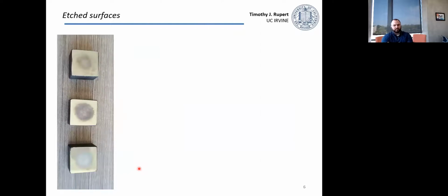All right, so this is what my etch samples look like from afar. You can see that that perfect mirror finish now has this cloudy appearance in all these cases. And even just to the eye, they don't all look exactly the same. Some are darker than others.